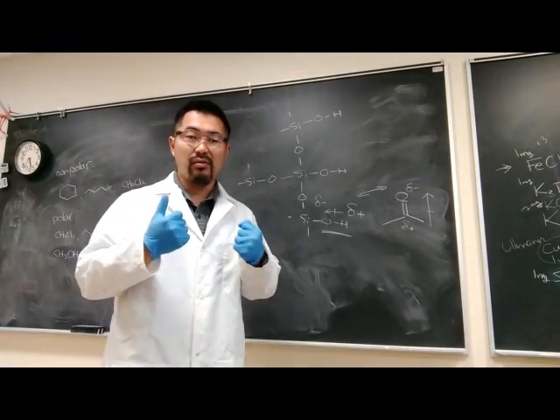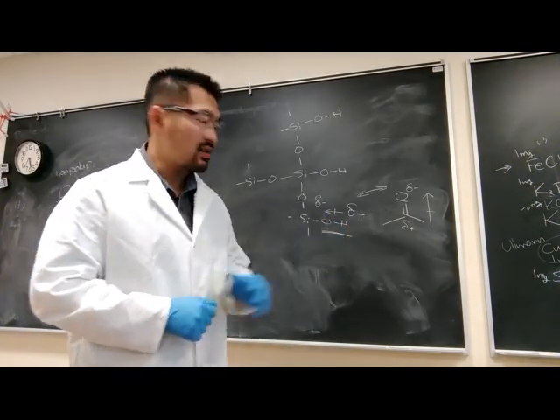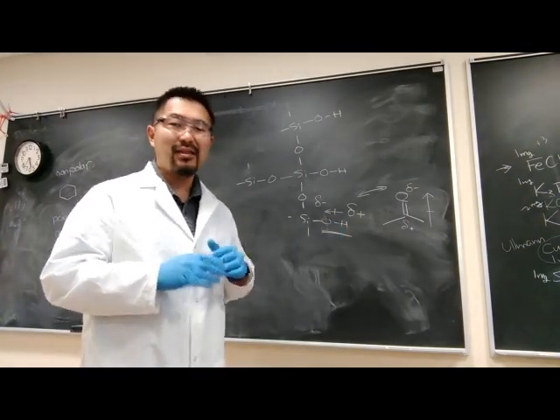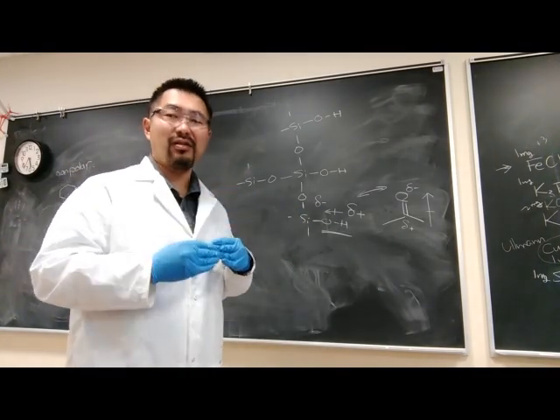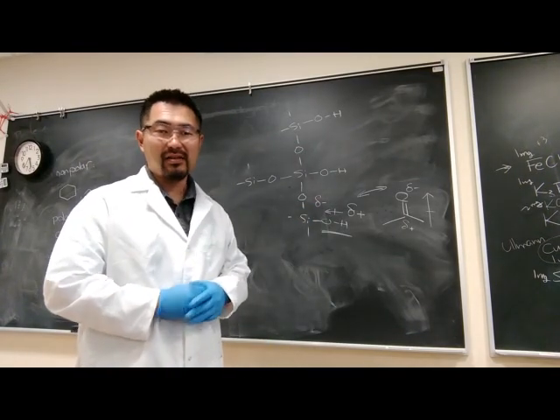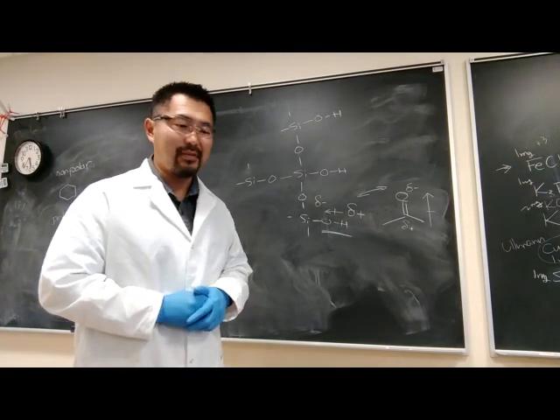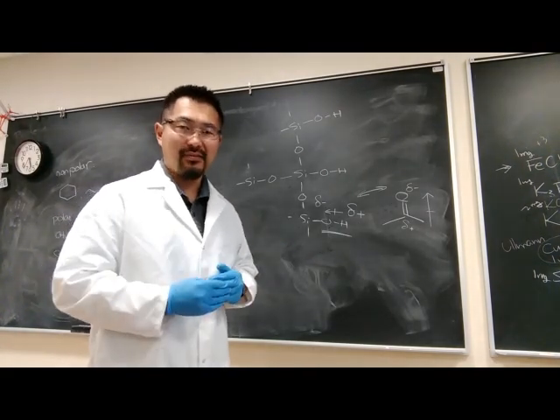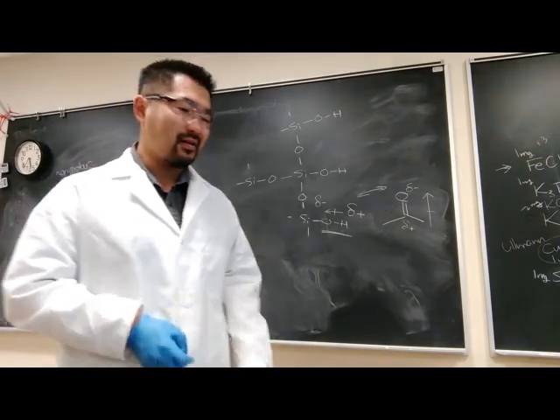I'll probably keep using the word interact. They'll interact with each other a lot. That means that those polar molecules will move slowly, going past silica gel molecules. And that's the key, how fast something can move past silica gel. That's the key concept in chromatography.